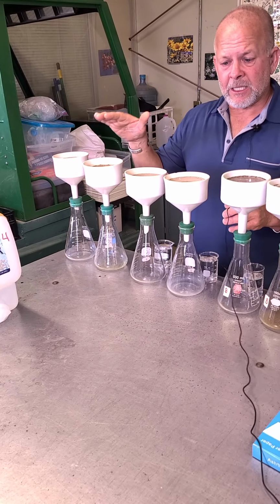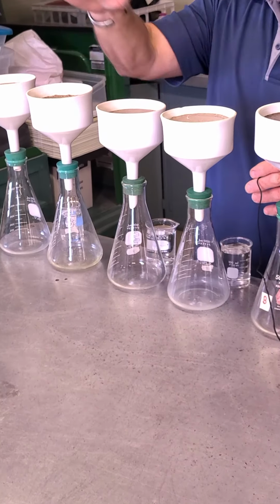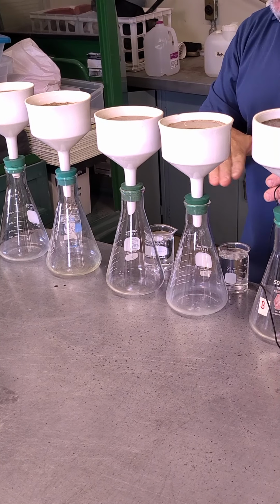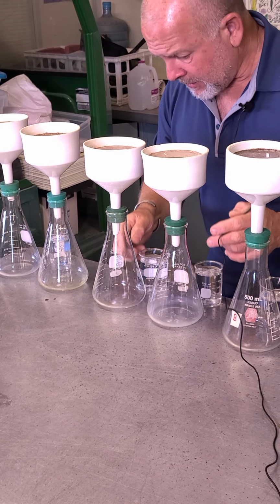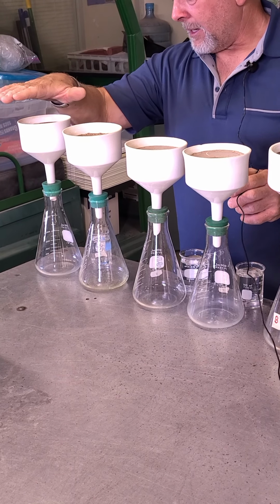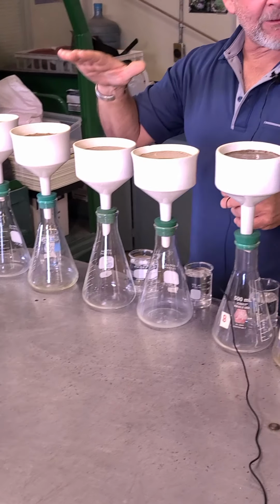Here I've got a silty clay loam, and I've got the 4 treatments: treatment 1, treatment 2, treatment 3, treatment 4. Again, refer to your lab handout to know which one those are. And look what's happening in through here. I see drops come through number 1. I see not much on number 2. Looks like number 3 is flowing pretty well. And number 4, I don't see anything really going on yet. So that's where we stand right now.